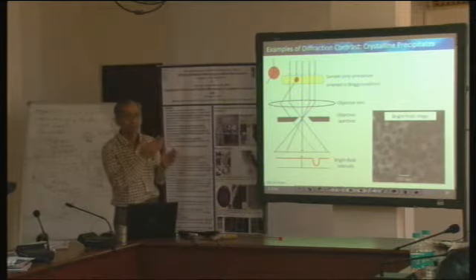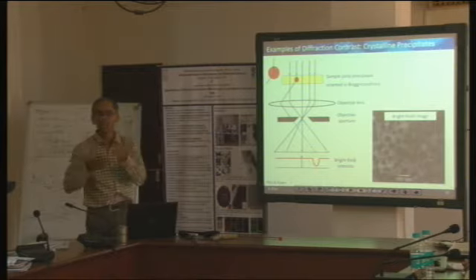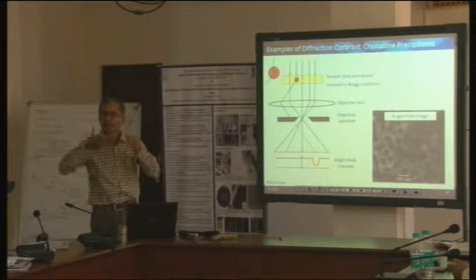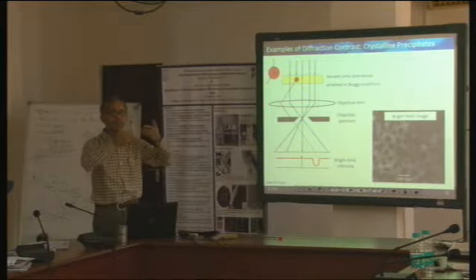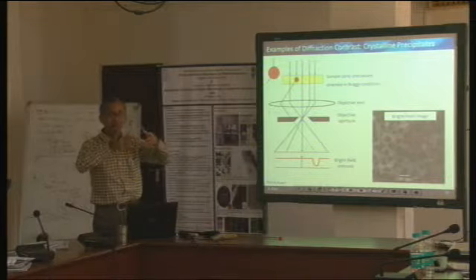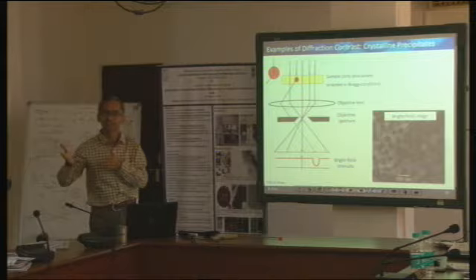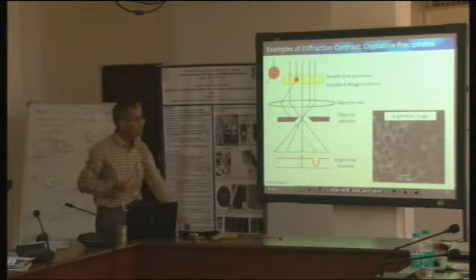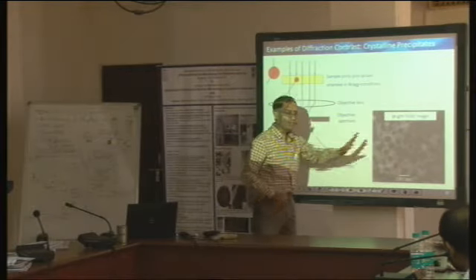In metallurgy, the metallurgists amongst you might be able to synthesize a material wherein all the nanoparticles or precipitates are crystallographically oriented in one particular way, whereas the matrix is oriented in another way. You can then orient your sample in such a way that only the precipitates satisfy the Bragg diffraction condition and the matrix doesn't.